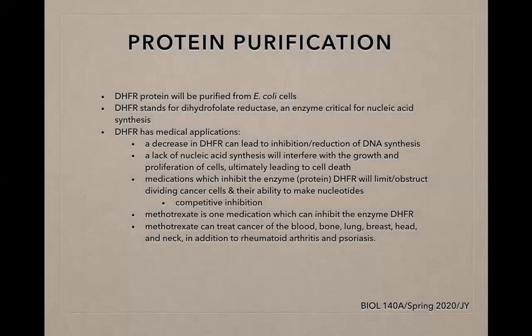This lecture will be a review of protein purification. Initially, we started with the DHFR protein, which we would later on purify from E. coli cells. So prior to beginning the experiment, these E. coli cells had actually been transformed so that they would contain the DHFR protein.